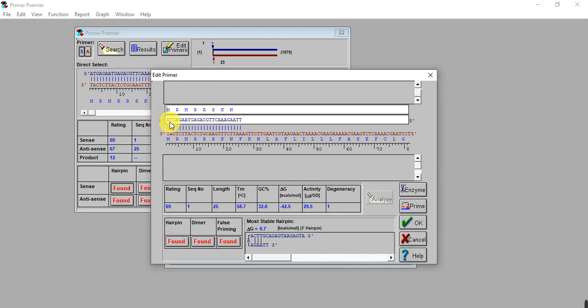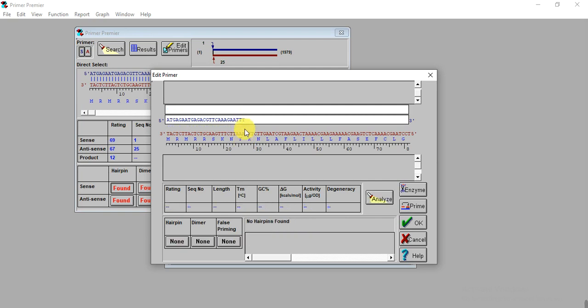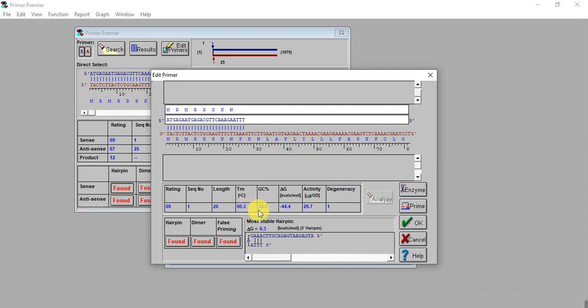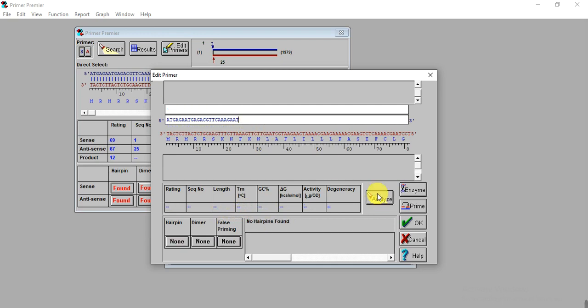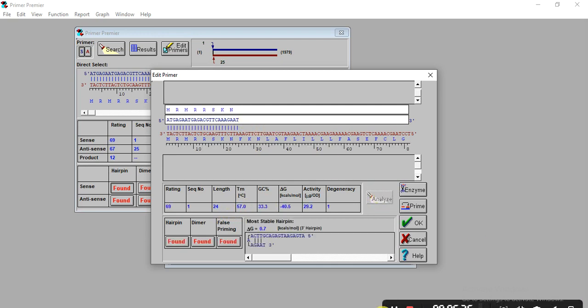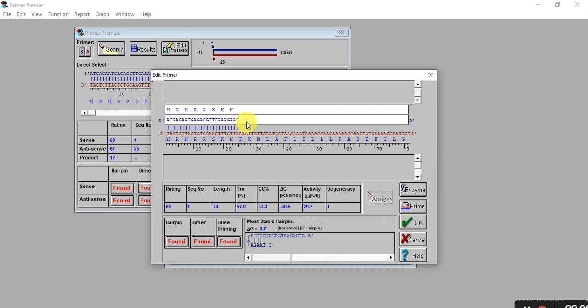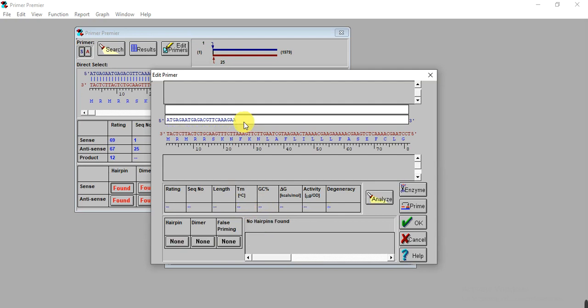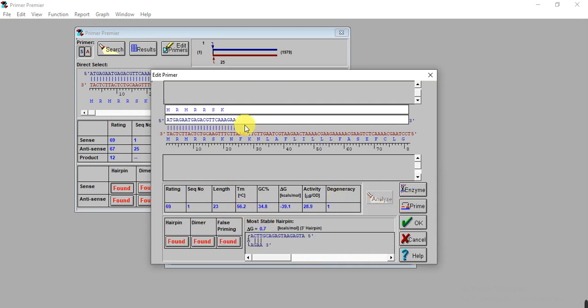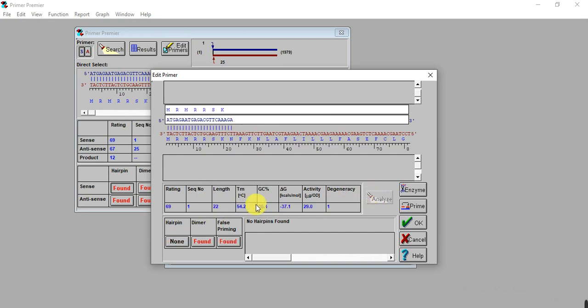This is the three prime end and this is the five prime end of the primer. After A, here is T. If we add and click Analyze, it will give you the temperature and GC content. We have to remove that base pair and then analyze. But still it has the hairpin. We need to remove another base by clicking delete, then analyze. We also need to remove another A.